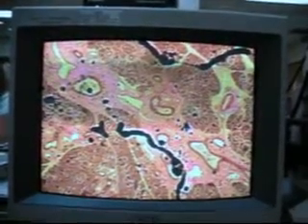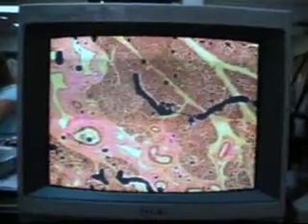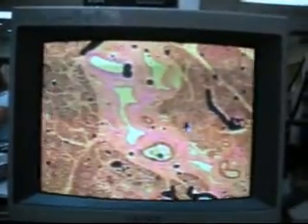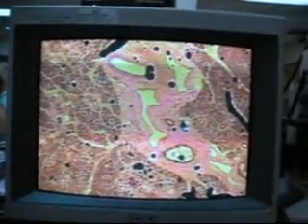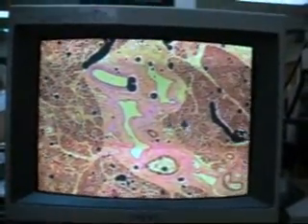Submandibular gland, and it's again a salivary gland, and so it's going to be basically the same as the parotid gland, where you're going to have vessels and ducts and arteries and veins in the connective tissue and also in some of the secretory tissue.